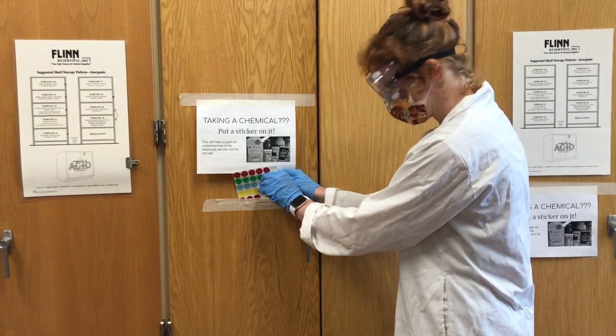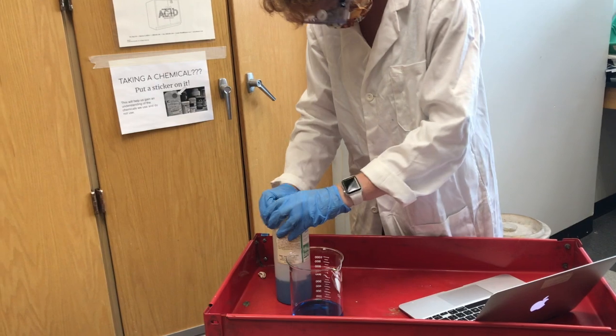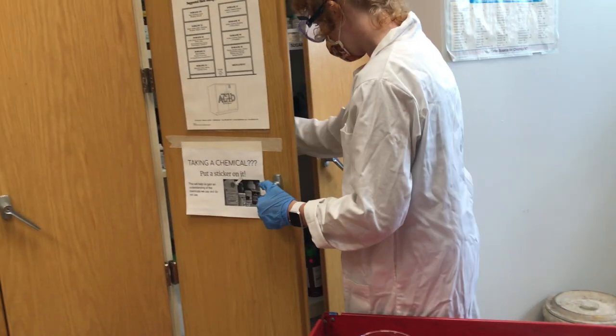Place a sticker on the chemical bottle. This is to know what we use and what we don't. Then place the bottle back and cart your chemicals to your room.